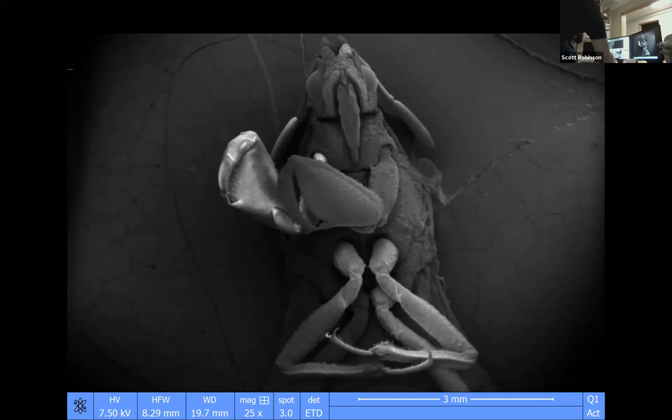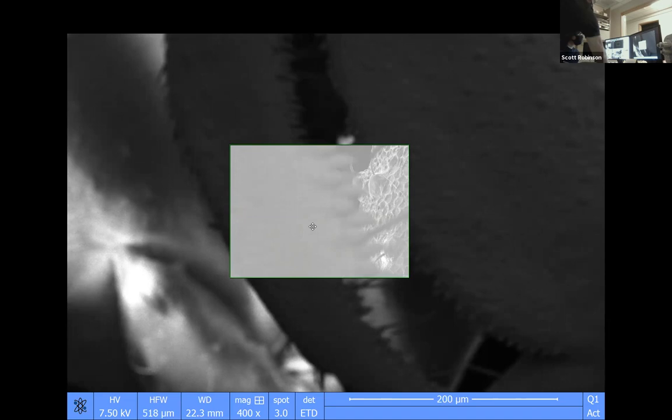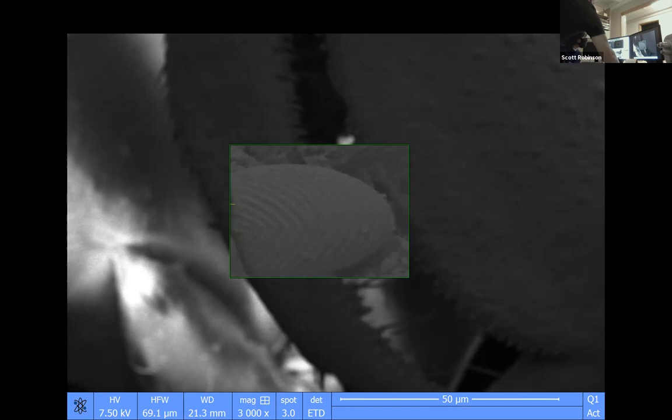So if we go like this and bounce the mag up, and then focus right there. Bring the light up a little bit. A little bit too much. How's that? So let's fix the brightness. This is really cool. Oh, wow. Look at that. That's crazy. I've never seen these guys close up before. So this is. Here's the auto contrast and brightness right there. Let's see if that works.